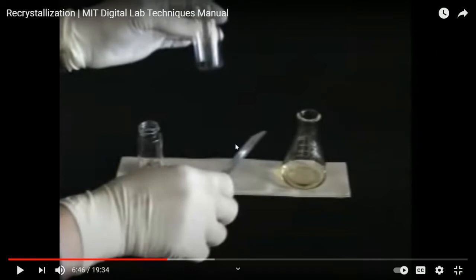Let's keep going. The answer is yes, you're right. We want the crystal to be dissolved, right? But we were only able to dissolve it when it's hot. When it's cold, when we choose the solvent, right? The qualification for a good solvent was that it was not able to dissolve at cold. So if you cool down, it won't be able to be dissolved. It'll come out. That's not what we want. We want the compound to be dissolved and stay that way until we finish. So that's why you don't want to cool down too much in the ice bath or cold water.